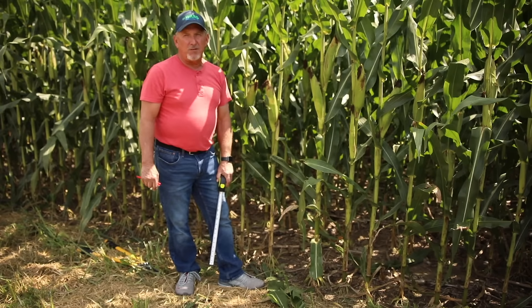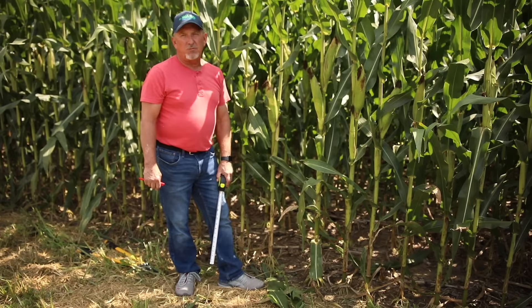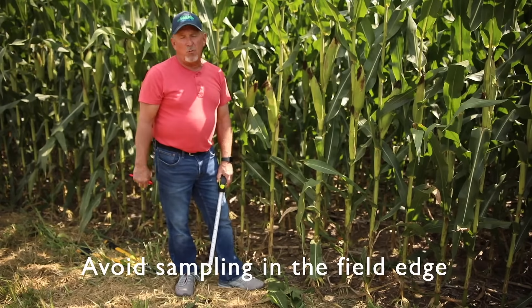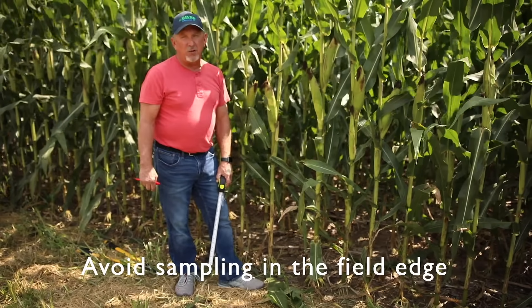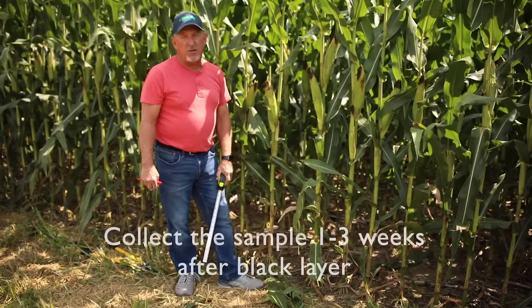Today we're going to demonstrate the proper technique for collecting corn stalk samples for the corn stalk nitrate test. Normally you don't want to collect on the edge of a field — you want to get out in the field. For demonstration purposes we're going to be out here on the edge though.